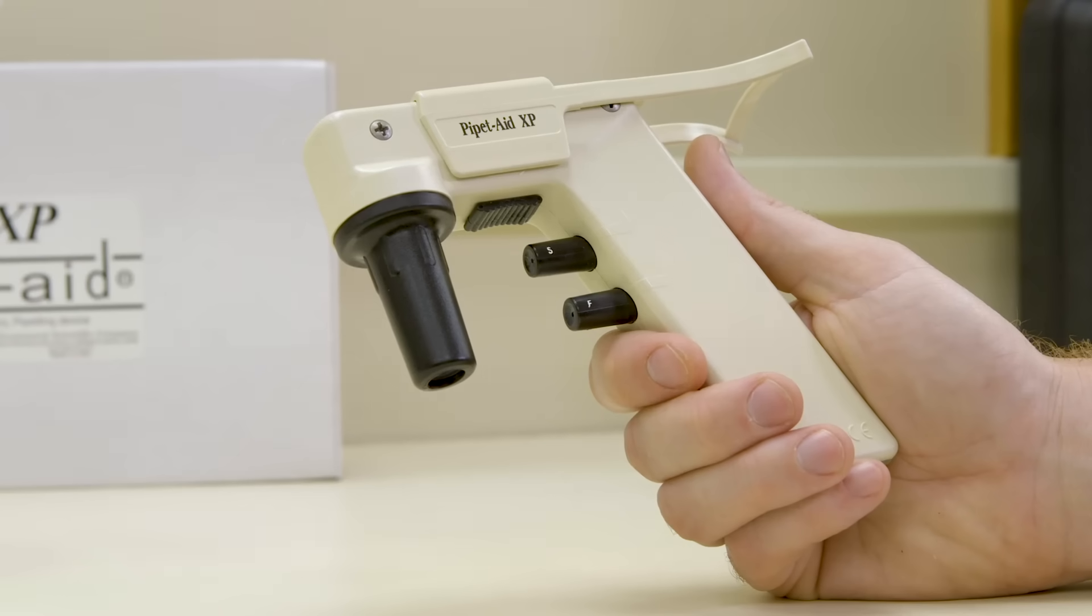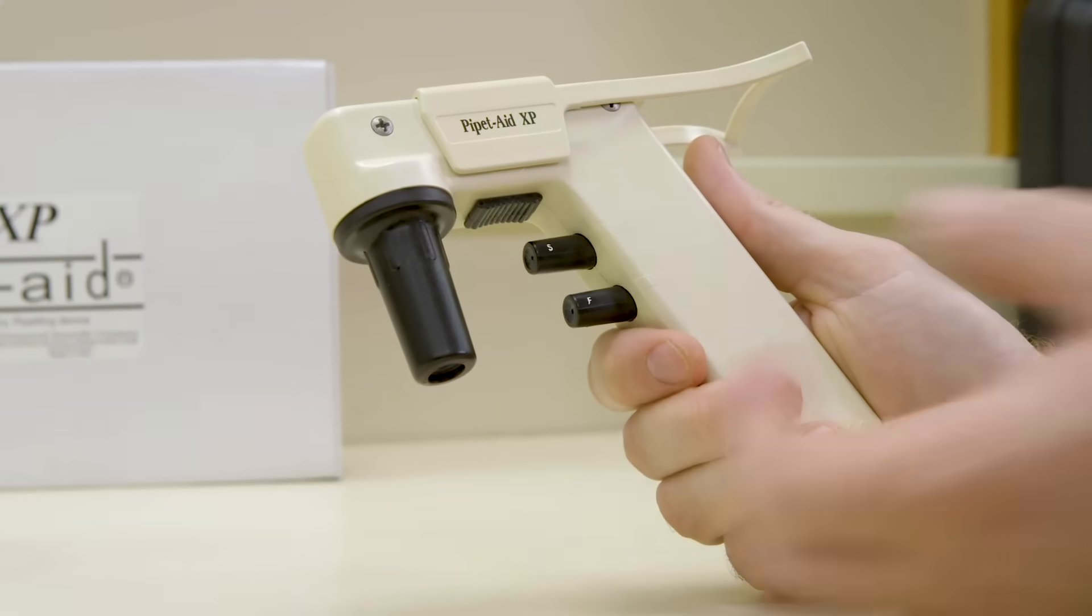When held in the right hand, you must be able to see either an S, M, or F indicating your current speed range. As you rotate the buttons, you should feel resistance followed by the button clicking into place.